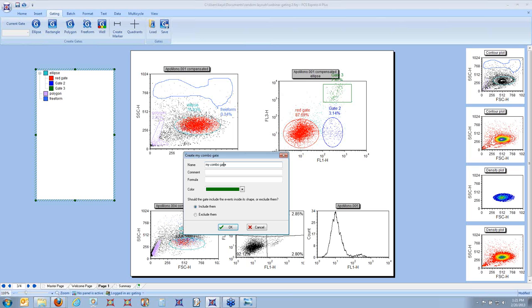And I see a question coming up asking, can we convert color dot plots to other dot plots like density? Yes, you absolutely can convert plot types at any time, and that's something you would do on the Format menu.